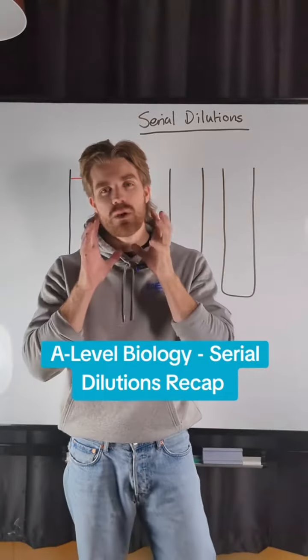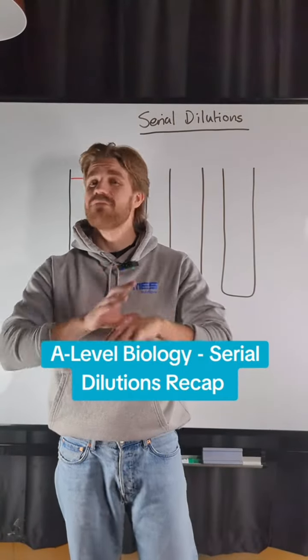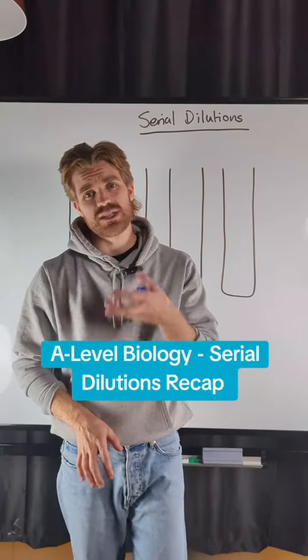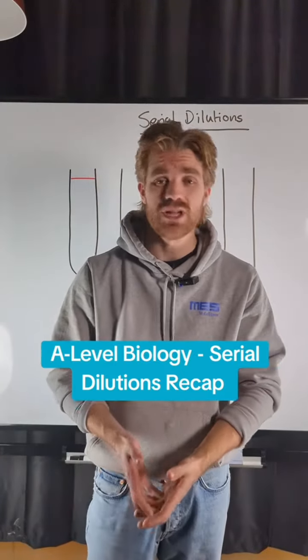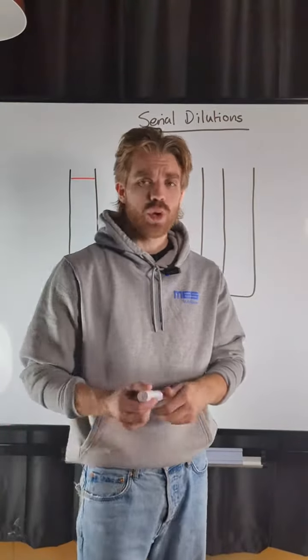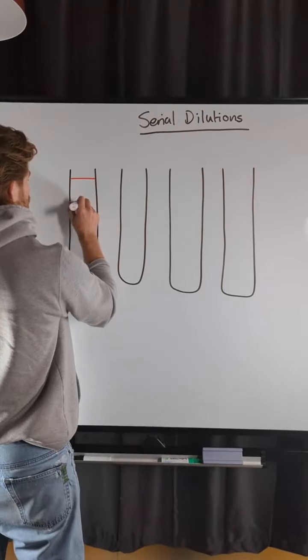This puts fear into most A-level biology students, and most just don't understand it. Let's talk about serial dilutions and how we prepare a serial dilution, and also why. Well, to prepare a serial dilution, we're going to start with a stock solution.